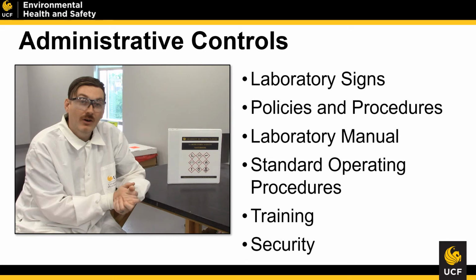One thing that we also need to talk about with laboratory security is that, depending on your role and depending on what you're working with, you may have had a background check. A background check is another way to indicate that we are keeping you safe. So please follow all procedures and practices within your lab from the university, your primary investigator, and the Environmental Health and Safety Department.